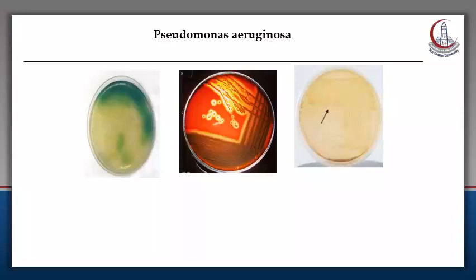But remember the difference between it and the TCBS plate. Yes, it is selective and differential for the family Vibrio. Okay, the second plate in the middle is the blood agar, and the effect of colonies on it is beta hemolysis, complete hemolysis. Don't forget, the blood agar should be lifted in the light to see the transparent zone around the colonies.